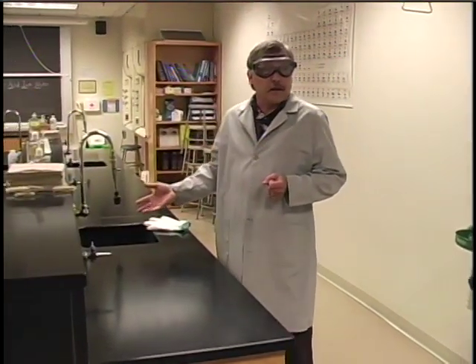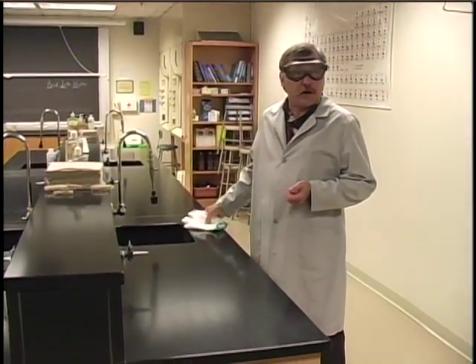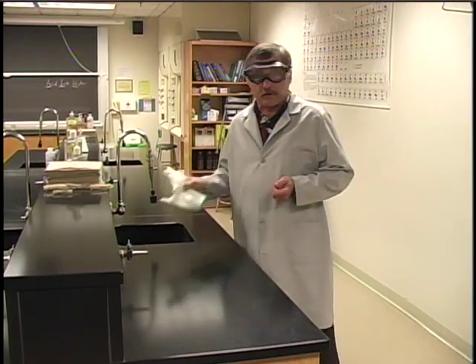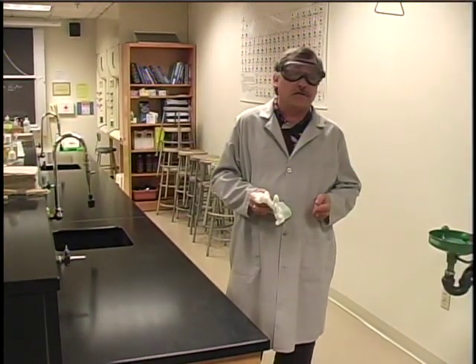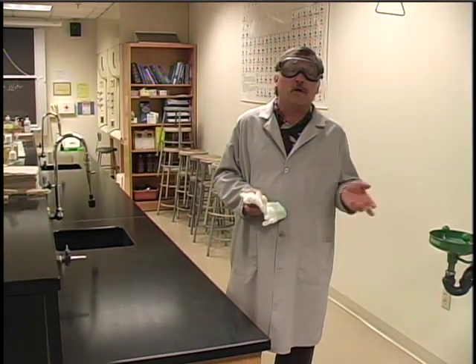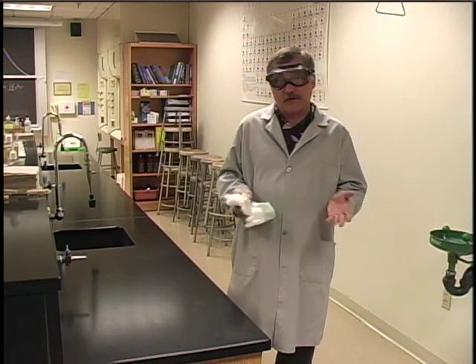If the glass falls in the sink, the broom and dustpan don't work. In that case, ask the instructor — we have special gloves for picking broken glass out of the sink. When you're finished disposing of the broken glass, let your instructor know what piece of equipment was broken and he or she will replace it without any charge to you.